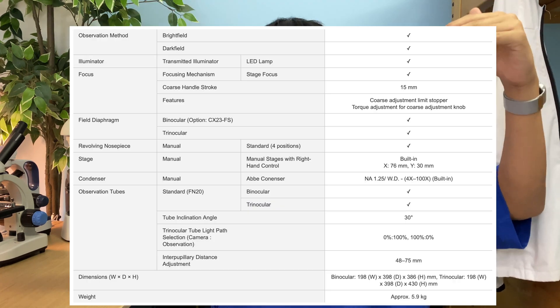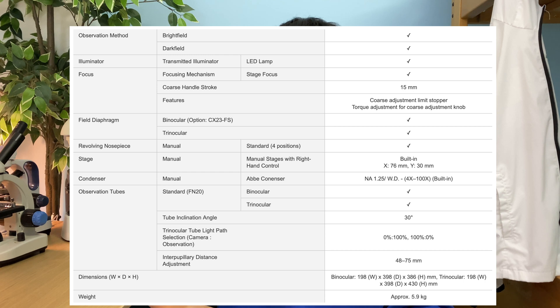Now let's talk about the specs. Basically, the Olympus microscope has everything a standard, relatively high-end microscope should have, meaning that it has binocular eyepieces, four objectives, a mechanical stage, coarse and fine focus knobs, a light intensity regulator, a condenser, a diaphragm, and a cooler illumination attachment possibility. This microscope weighs about 6 kilograms and it's made up of plastic and metal combined together.